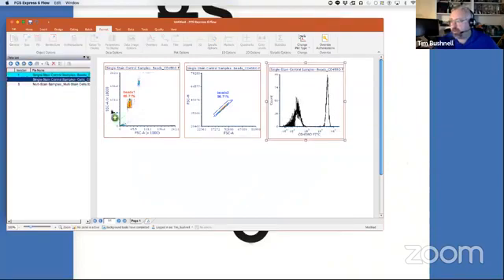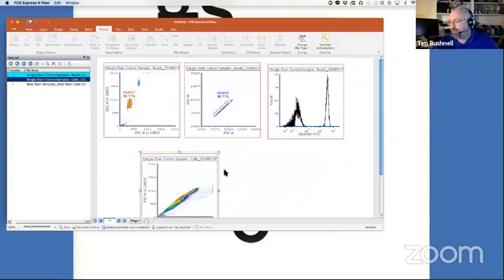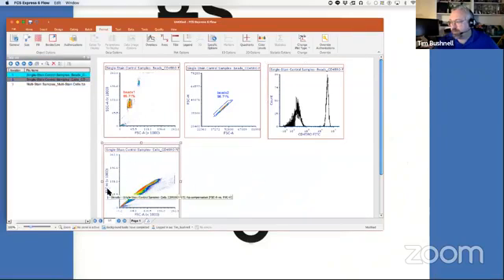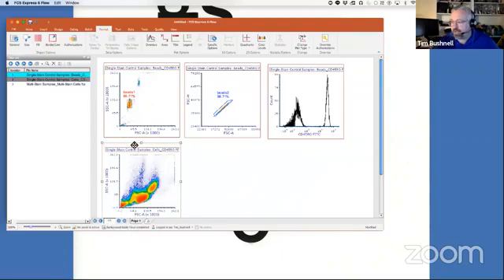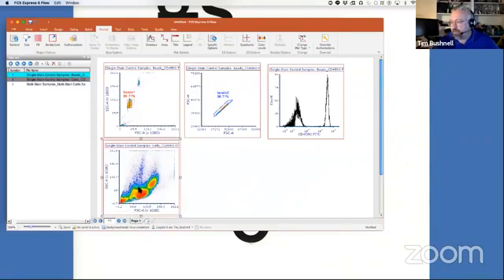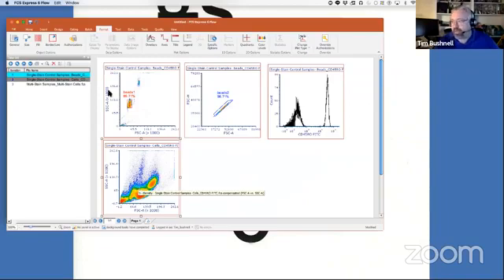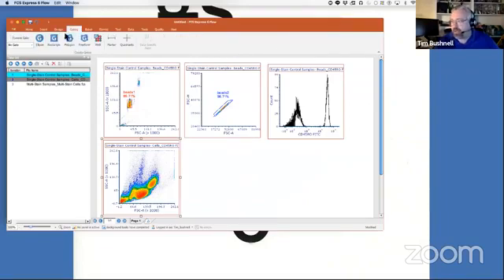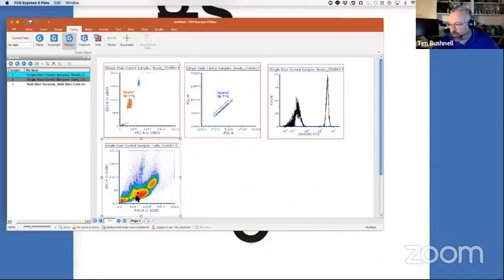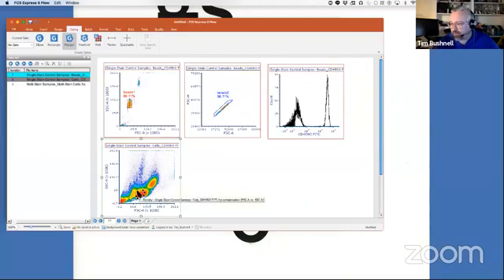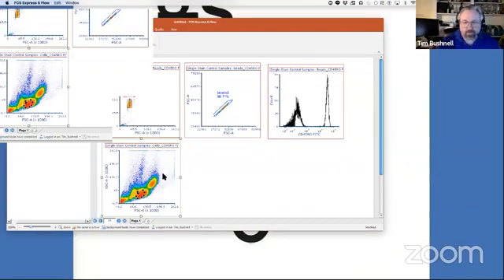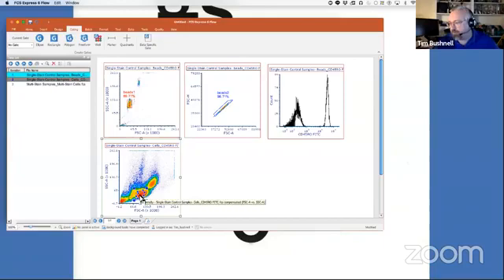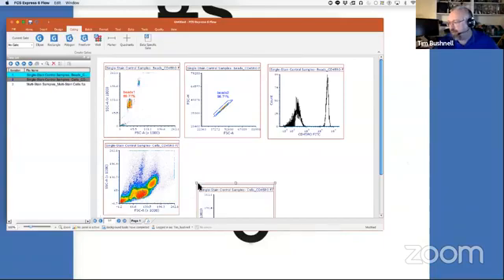We take a look at our cells. Again, we're going to do the same thing. We're going to start with our cells looking at the population. Now, it's really important when you're gating using cells that we get a tight population around a similar auto fluorescence. So you'll see here I'm just taking the center of this peak, what we consider, a lot of people consider them lymphocytes.